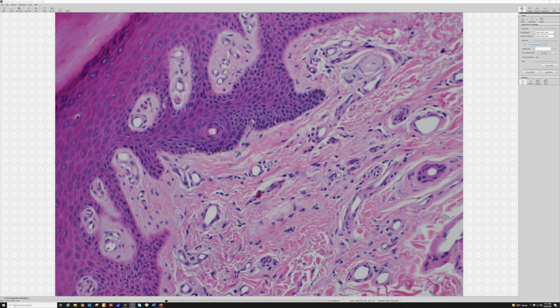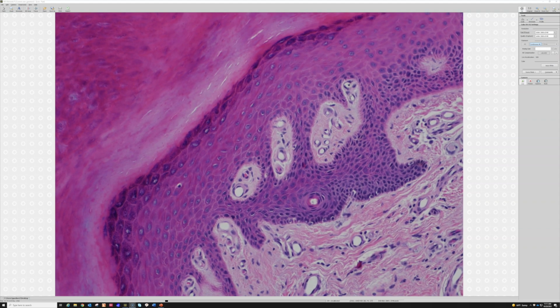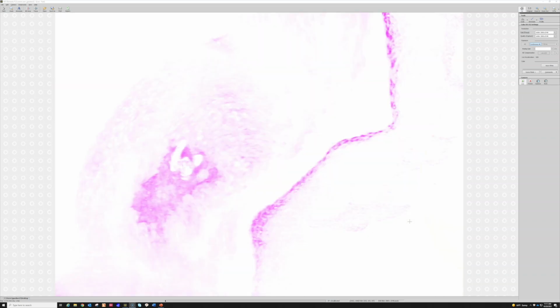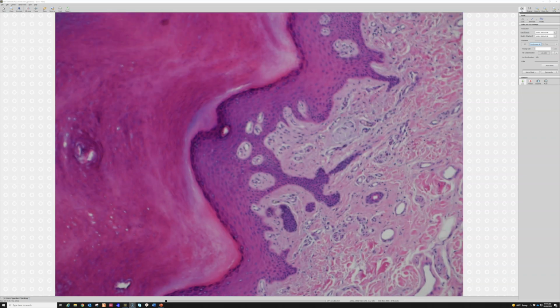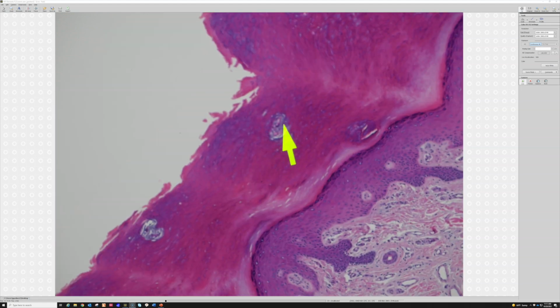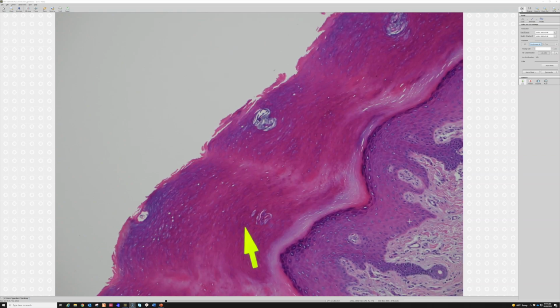So next time you have sweaty palms because you're nervous about something, think about this process happening here. The sweat's coming out through these little, spirally tubules called acrosyringia. I always think these are pretty cool to look at, and you can see the color of the stratum corneum kind of changes right around the opening here. The keratin is kind of a different pattern here. See, there's more of them.